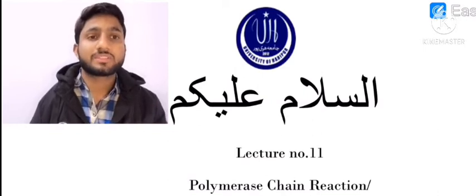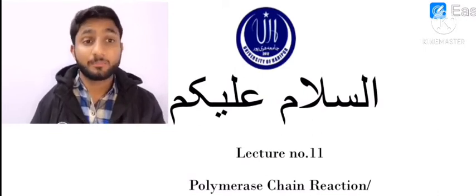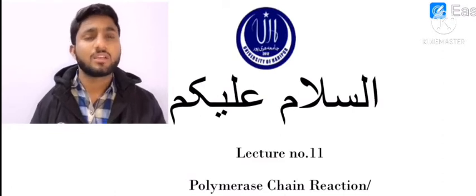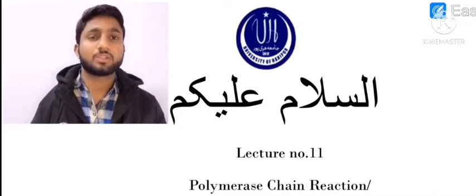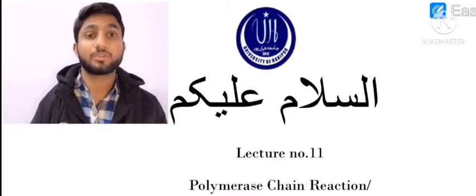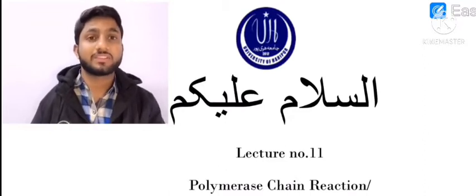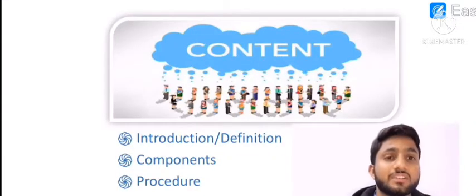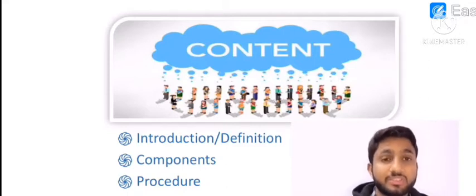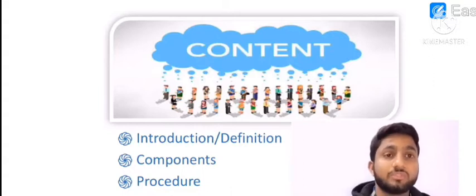So today we are going to discuss lecture number 11, which is regarding polymerase chain reaction, PCR. Most of you belonging to the lab technologist profession, other medical technology related professions, microbiology, or biomedical engineering know very well about polymerase chain reaction or PCR. In this lecture we will discuss in detail what PCR is. In the introduction we will discuss the different components of PCR, then the procedure, meaning how we can conduct PCR, and then a summary or conclusion.